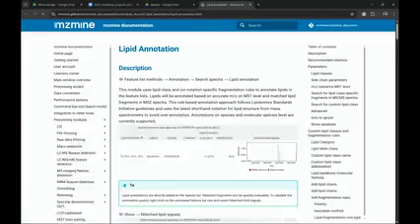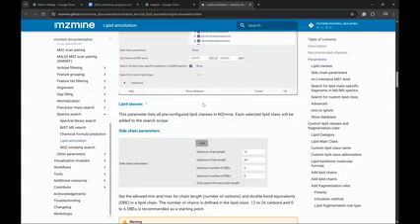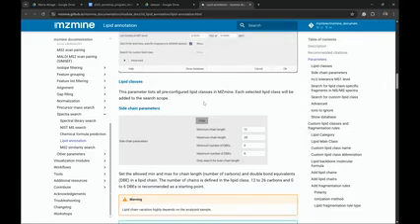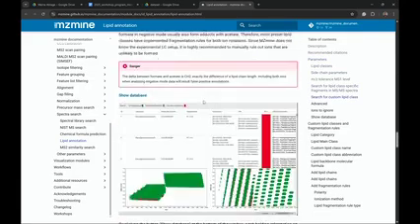And you can always click on the help. You're going to directly go to the documentation, find some information, and if there's something missing, again, please just tell us, right? Don't silently just say, oh, that's not good. Just tell us if something could be improved, and of course, maybe even improve it yourself because it's open.